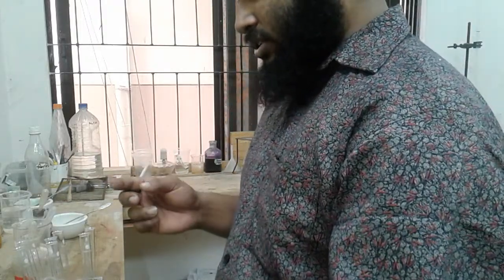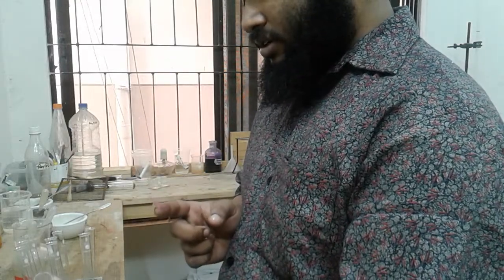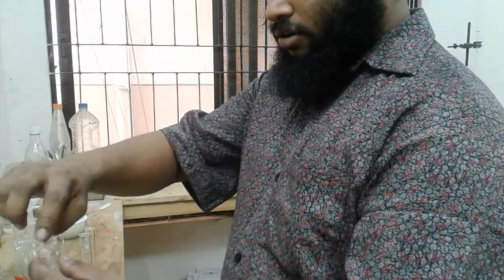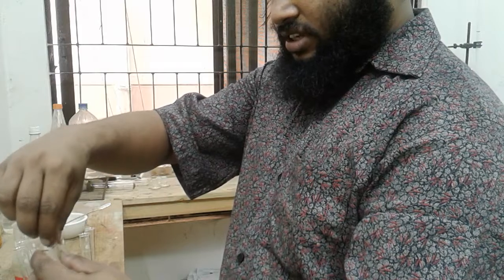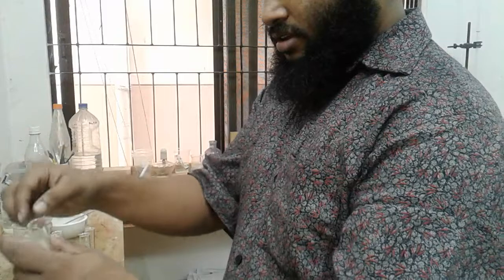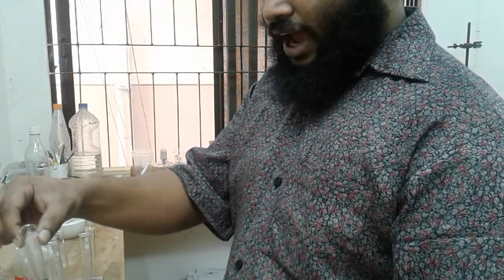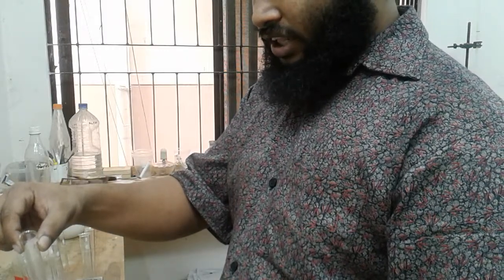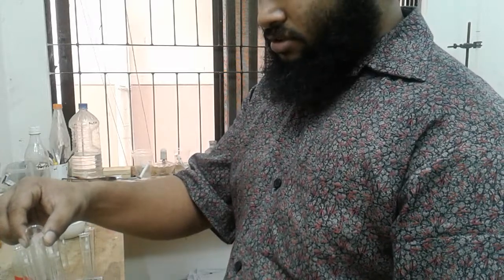Like I'm heating the solution, and here I have the damp red litmus paper. When I'm testing the gas, I will be holding the litmus paper like this. I have just kept it over here and carry on heating. Look, I'm heating by hand, but during the examination you must use a test tube holder for heating the solution.